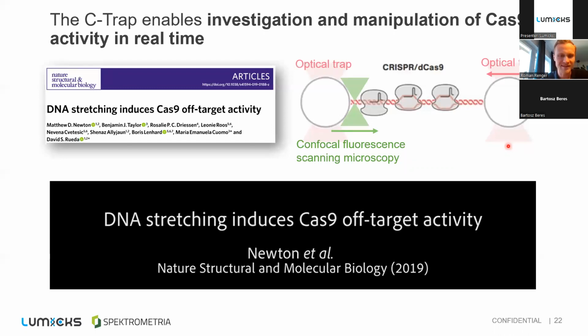And whenever mechanical tension on the single-molecule level is involved, optical tweezers are a very nice tool to study these processes. What the authors of this paper then did was trap two plastic particles in optical traps. They connected these two beads with a DNA molecule that has a certain target sequence, and they incubated this with Cas9 complexes that had the corresponding guide RNA sequence.